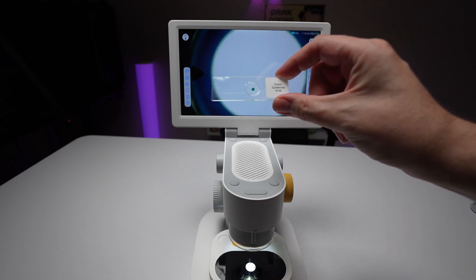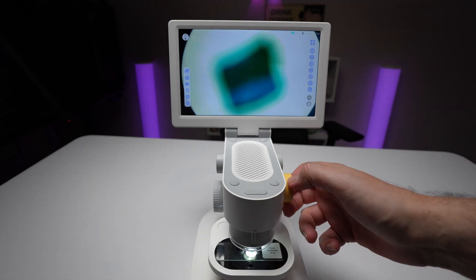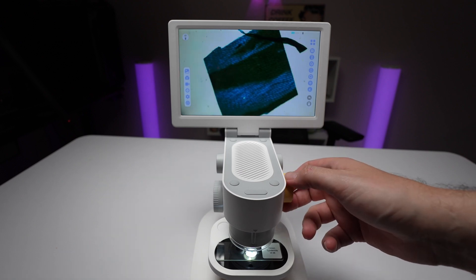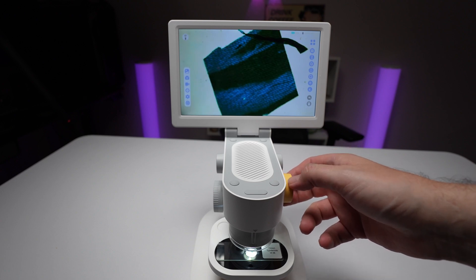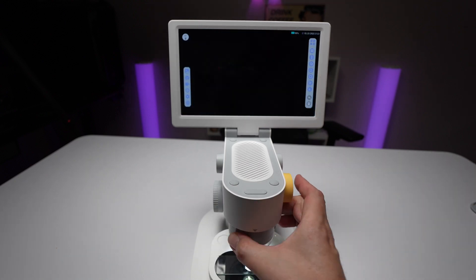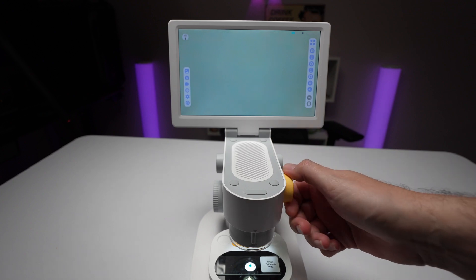Now I got an onion epidermis. We can also bring it a little bit closer and refocus. That's a microscopic view of an onion epidermis. I tried using the higher magnifications but depending on what you're trying to look at, it doesn't always work too well.